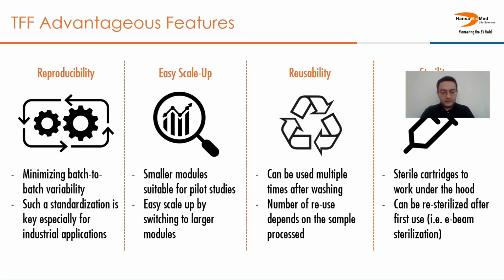So this is a very easy approach of scale up. Then there is also the reusability of TFF cartridges, which allows them to be reused multiple times, in between each use just by washing according to the protocol by the manufacturer. But here it is also critical to mention that this reusability does not come with a certain number of reuses, because it depends on multiple factors.